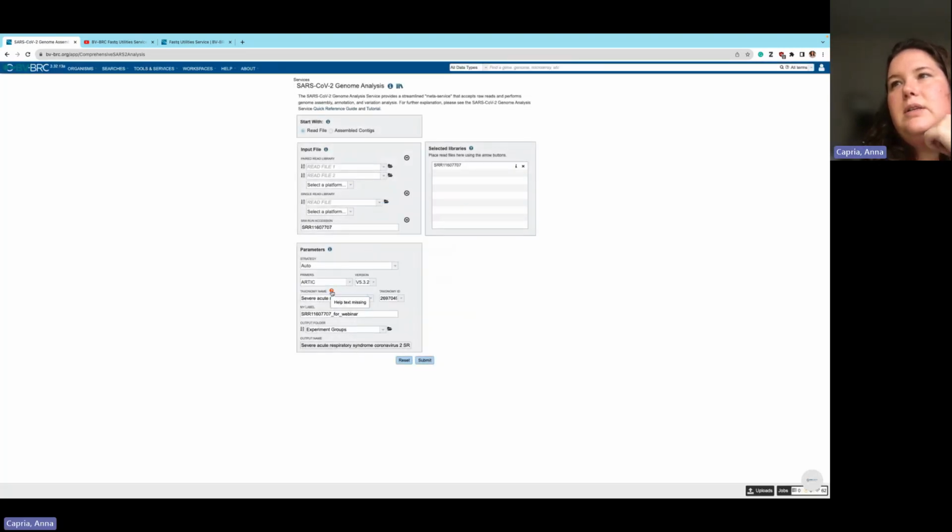But there are always help texts and things like that along with the tutorials and quick reference guides for you to use. So definitely use those to help with your analysis. So now we're ready to submit. Let's go submit that job.